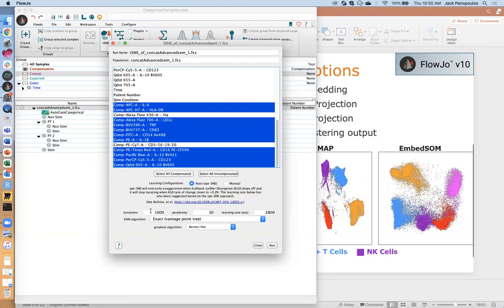Okay, so down below you have some options here to choose the number of iterations. t-SNE is an iterative algorithm. It looks at the landscape once and tries to see which populations of cells are present or if there's sufficient density. It goes through another round and refines that landscape, so to speak, multiple times until the populations resolve themselves.